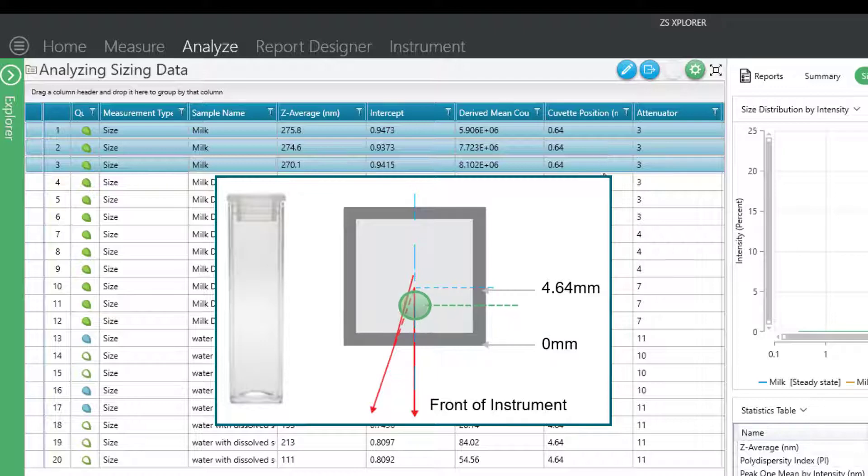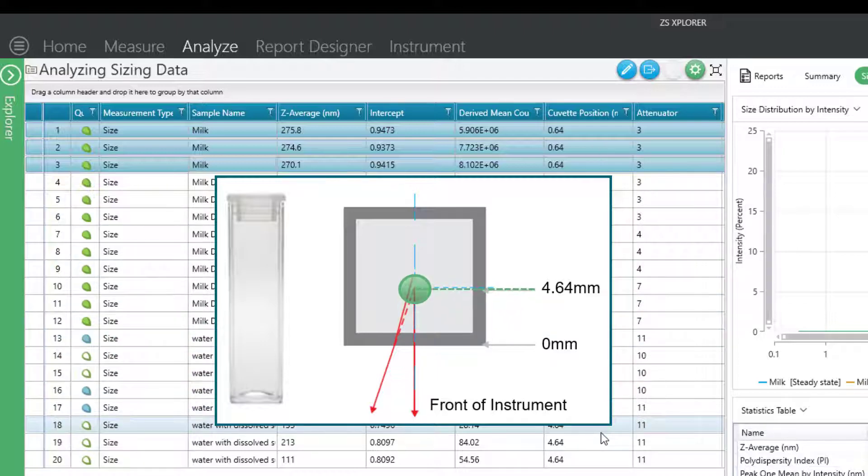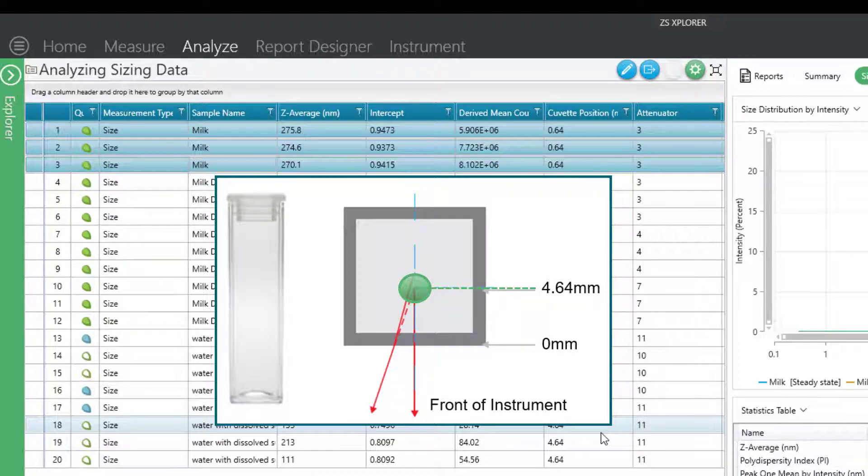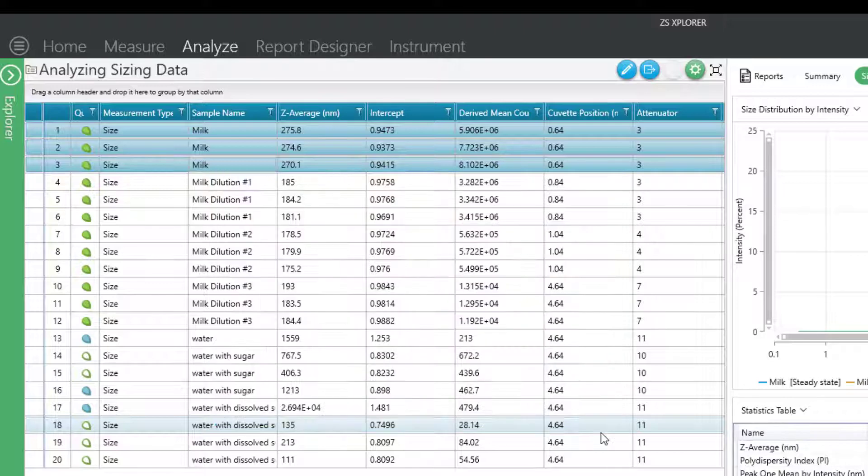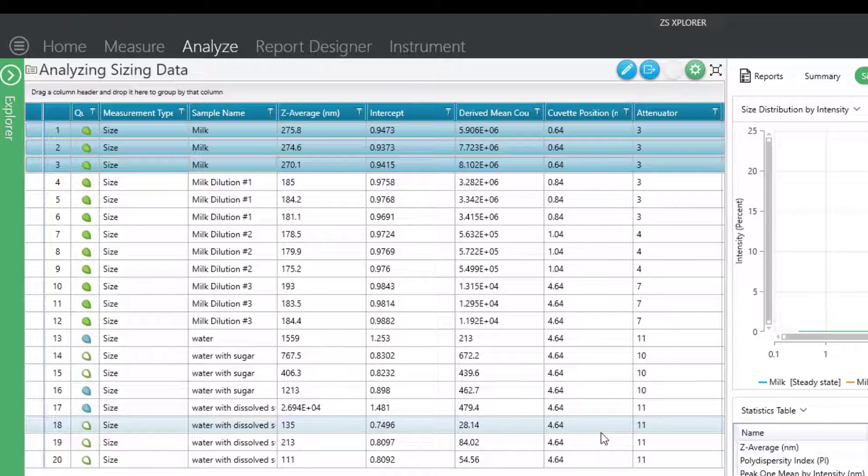However, on some of these other samples, if you notice that we are measuring at 4.64, that's the center of the cell for the common disposable sizing cuvette. And so that would say the sample is quite dilute in nature. So this already gives me an indication that possibly my sample could be a little bit too concentrated to give me accurate sizing results.